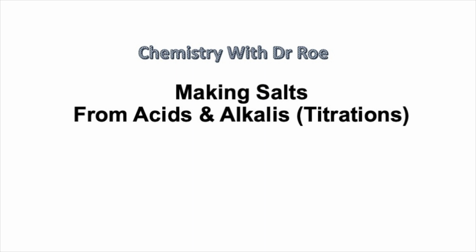Welcome to our latest video on making salts from acids and alkalis, titrations. This video is suitable for GCSE students.